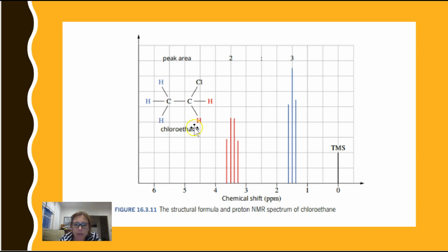In this case, again, we have 3 hydrogens attached to a carbon. That's going to produce its own environment, whereas this one here, we've got 2 hydrogens with a chlorine there, and that chlorine nearby is also going to have an effect on the energy that is required to flip the spin in alignment and produce a different signal again. And we can see that's come out here.